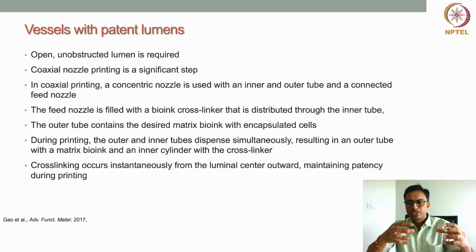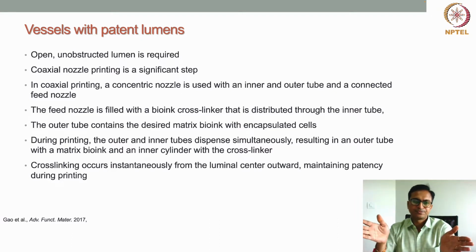So we get a tube-like structure filled with the crosslinker inside, and the structural patency can be very much intact because of the crosslinker present. The crosslinker will crosslink the channel from the inside out.